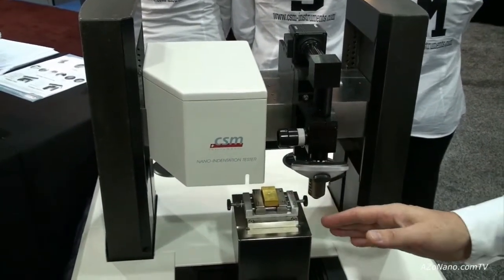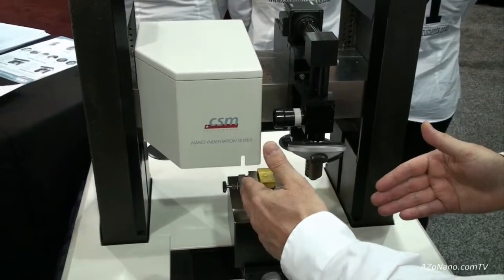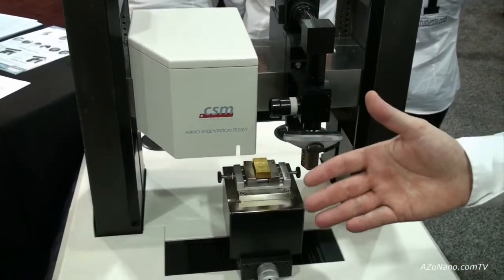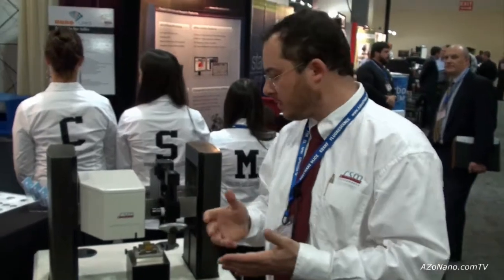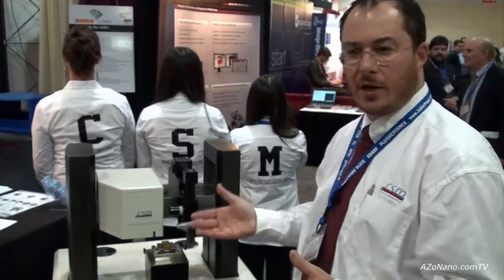Your sample is fully integrated positionally between the modules. Any zone you choose under the microscope to make an indent, you then go under the tip of the indentation tester and it'll make the indent in that spot. It's fully automated for large-scale matrices of tests. You can do a user-defined matrix where you choose on the sample where you actually make your test. This would be useful for both R&D and academic institutions, and you can upgrade it over time by adding other modules.